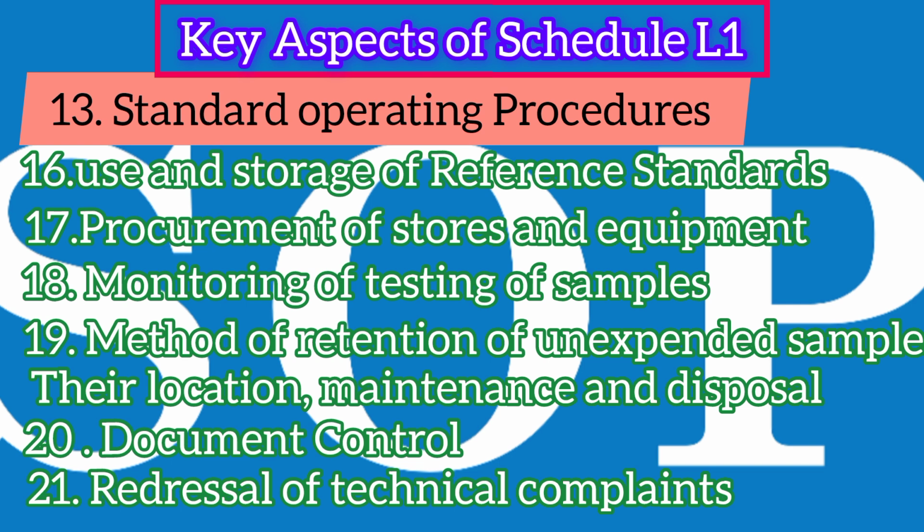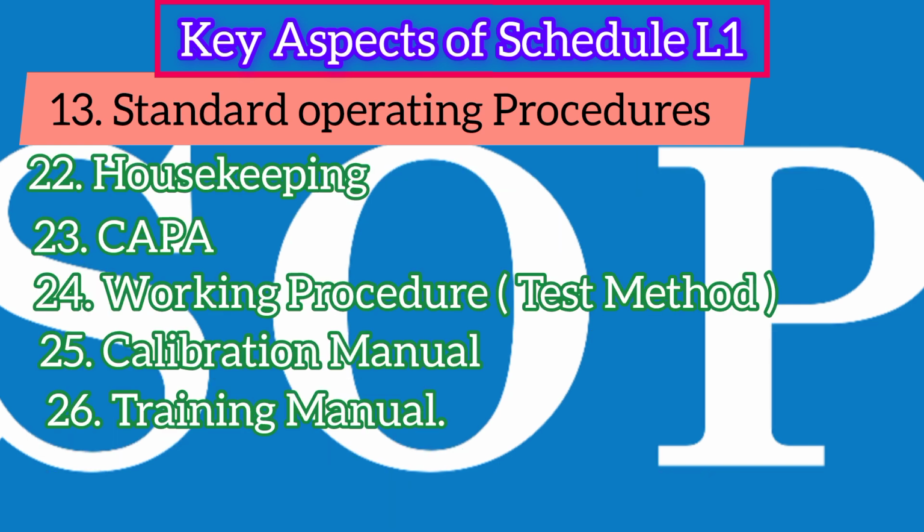20. Document control. 21. Redressal of technical complaints. 22. Housekeeping. 23. CAPA. 24. Working procedure, test method. 25. Calibration manual. 26. Training manual.